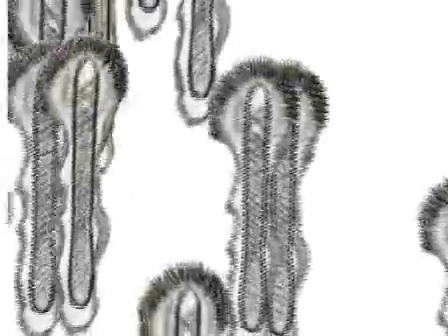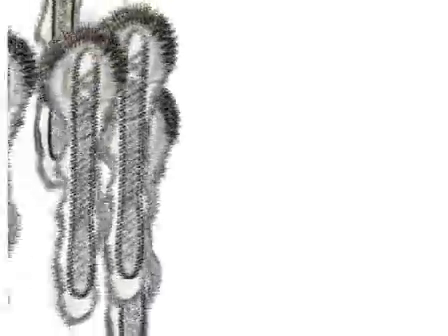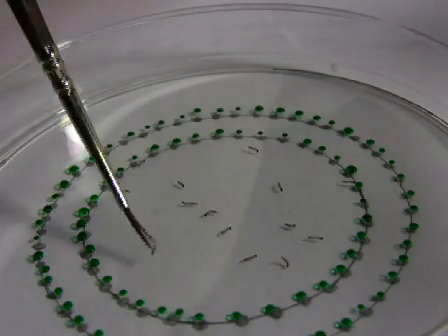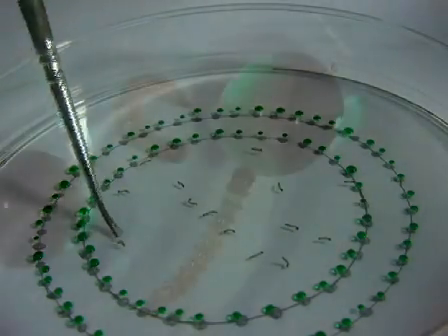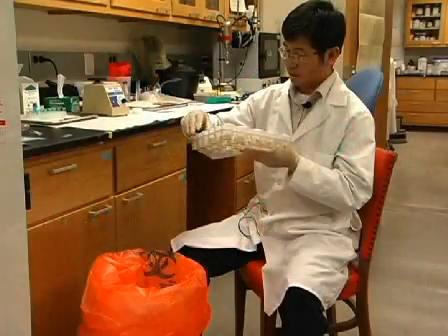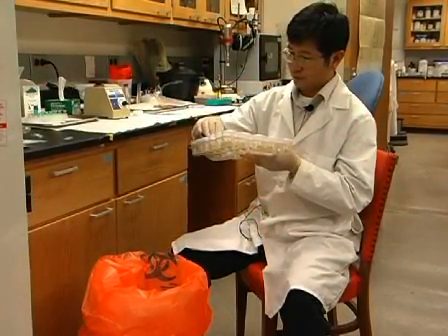To enhance their insecticidal efficacy, baculoviruses have been genetically engineered with genes encoding insect-specific toxins that are active within the hemocoel of the insect. In this video, we demonstrate methods for oral infection of Lepidopteran larvae with baculovirus in order to analyze insecticidal efficacy.